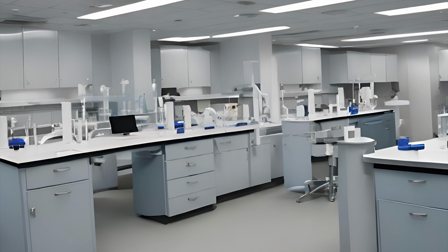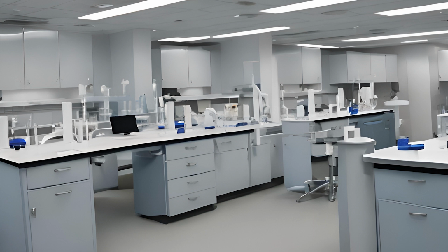Contact with a solid piece of ice can also potentially freeze a part of the specimen, which can hemolyze your cells. The formation of ice crystals is physically destructive and can damage the blood, so you don't want to just put something on pure ice. Other specimens will require a warming block to keep them at about 37 degrees, because there are some tests that will be interfered with if your specimen cools down.